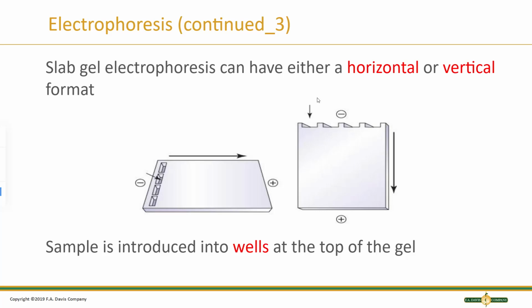Here we can see a vertical one. In this one, we would load it at the top and they would run down.